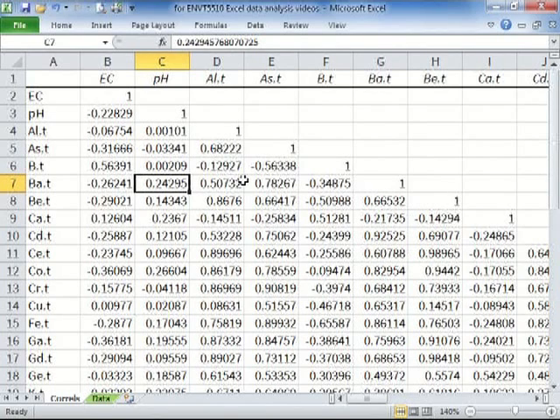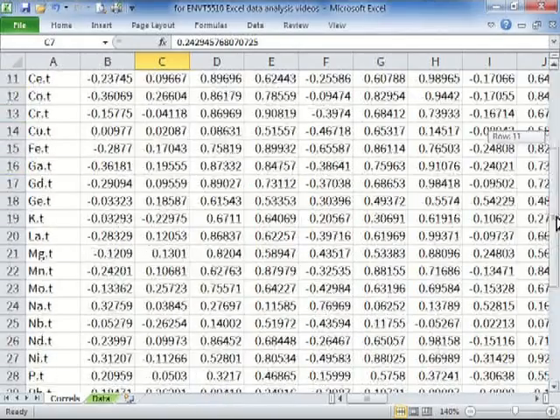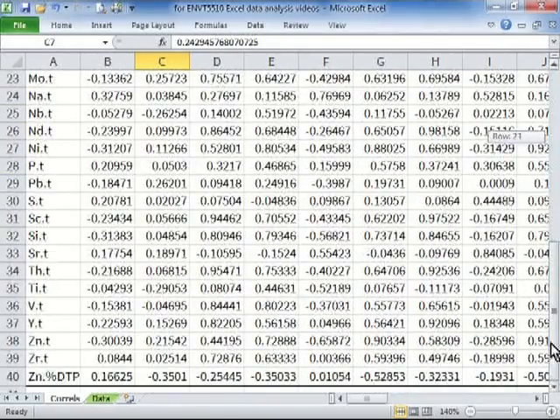Unlike a full statistical program, we don't have a statistical test associated with the calculation of the correlation coefficient. So we'll need to make some judgment for ourselves based on the R value, which is our effect size, if you like, for the correlation.